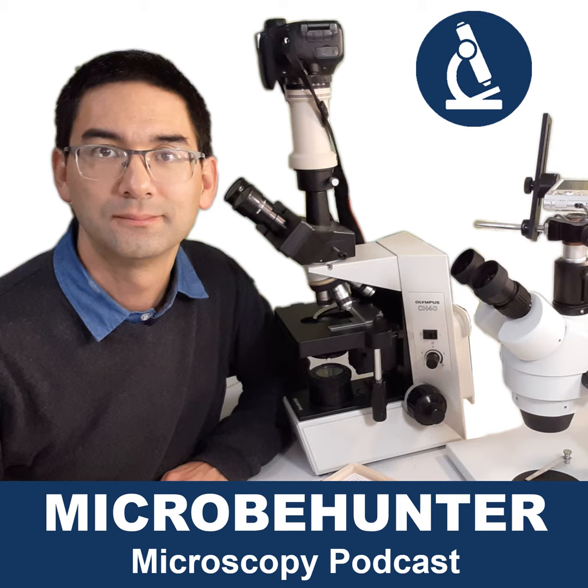But generally, if you want to look at water life, for example, that's one of the most common things in amateur microscopy. You go out and collect some water samples, some algae, maybe some yucky stuff from the bottom of the pond that you want to look at. Those microorganisms are too small to be seen properly without a microscope, obviously, but with a microscope they're surprisingly large. You do not need a lot more magnification than around 100 times or even 200 times.